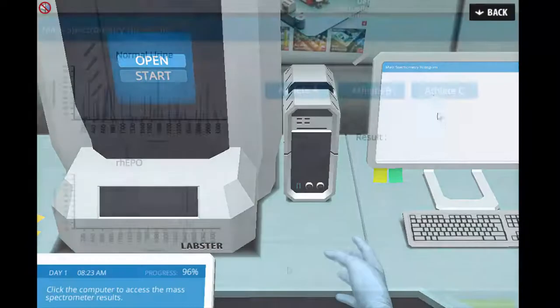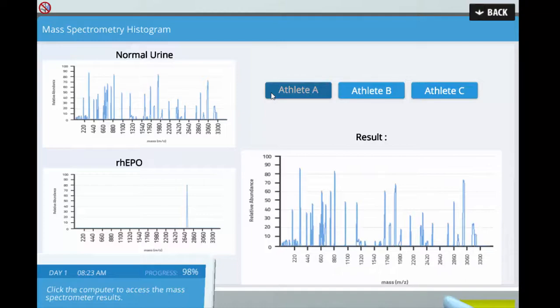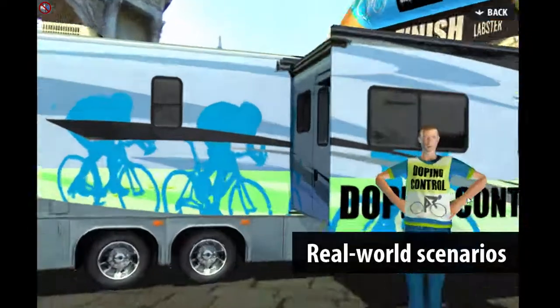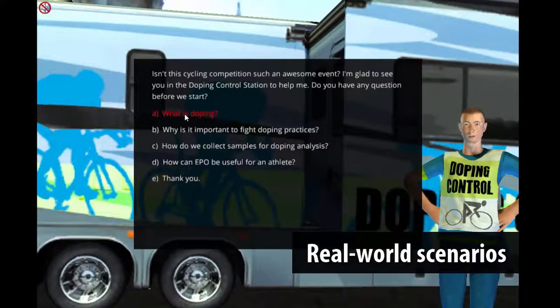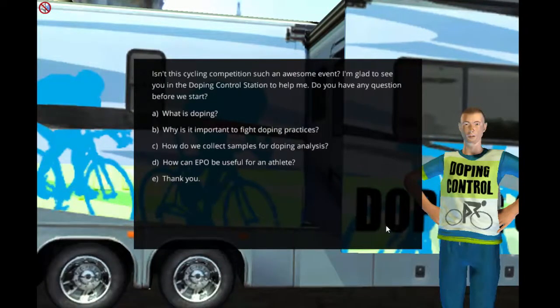In the last mission, students need to use mass spectrometry and investigate if there are any athletes who are using RHEPO as a doping substance. They will do so by collaborating with a doping agent who collects urine samples in a large bicycle race. Will they be able to find the cheating athlete?